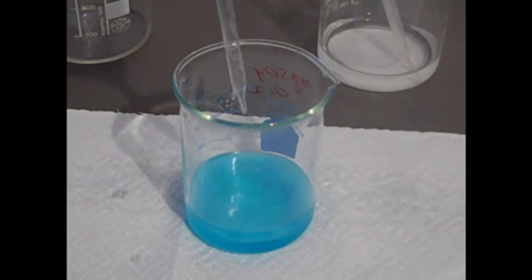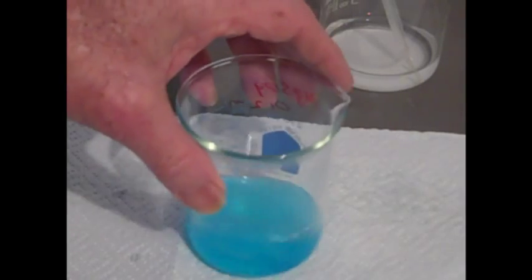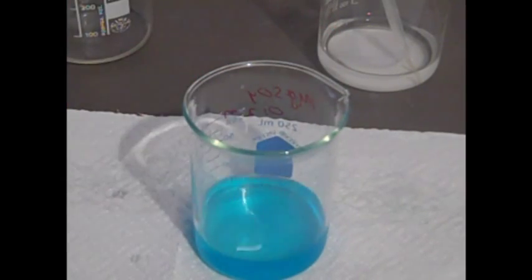That pretty much has it. Let's swirl it. See if we can get all the copper carbonate to dissolve. It does. And it's clear again.